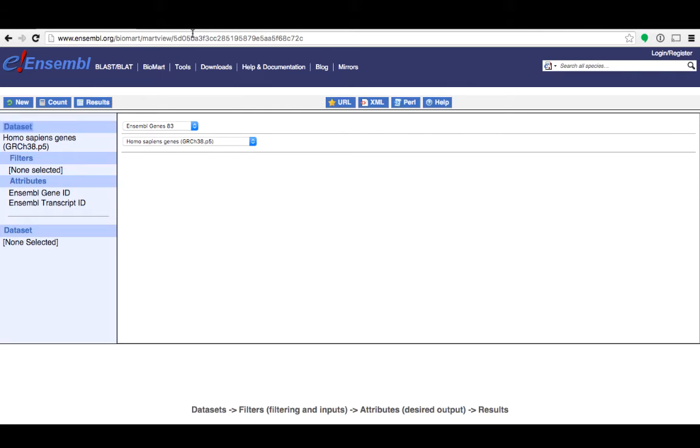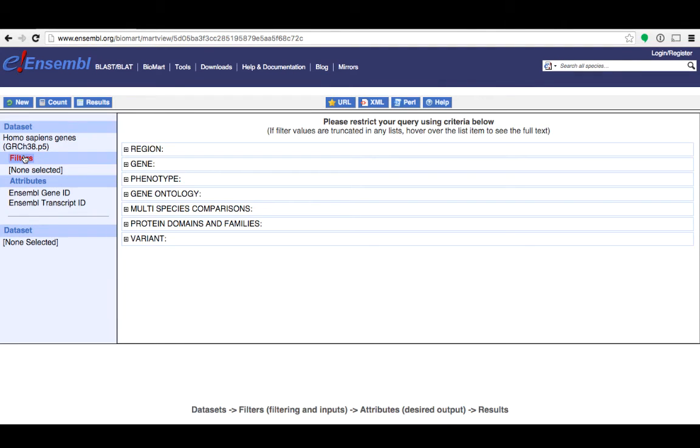To narrow this down I need to add filters. Filters are your input data, whatever you want to find out more about. Filters are divided into these seven categories.